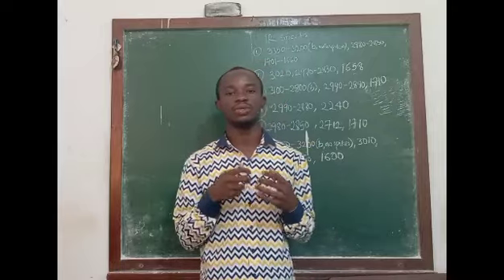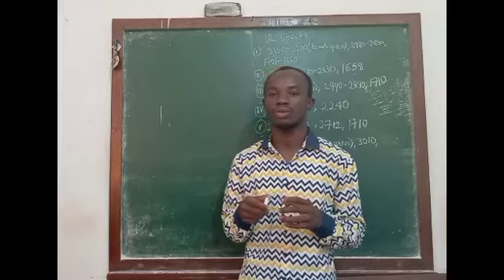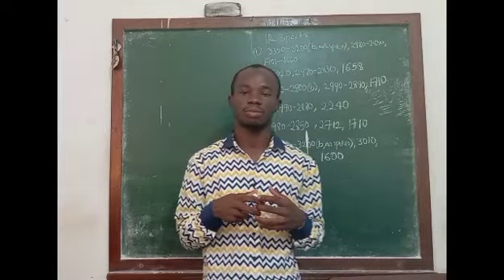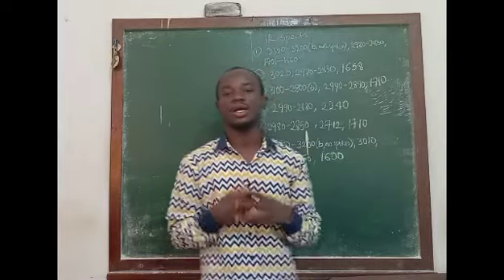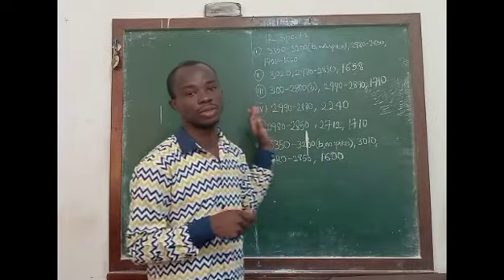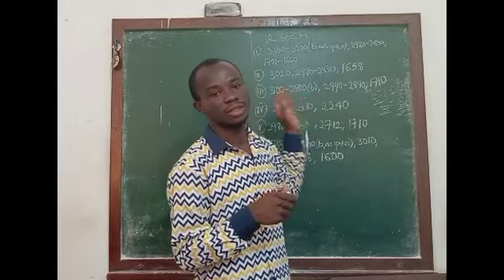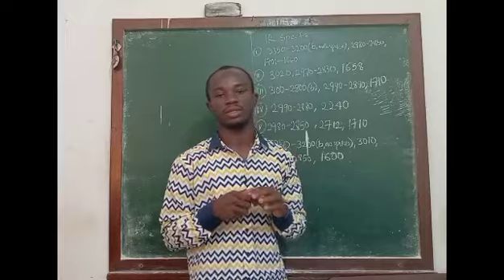In this video, I've given us the completing part of the signals that we have to look out for in some other compounds, apart from saturated and unsaturated compounds, and apart from carbonyl compounds. At the end of this video, we are going to be looking at these IR spectra and using the given values to elucidate what class of compound each of the IR spectra might represent.